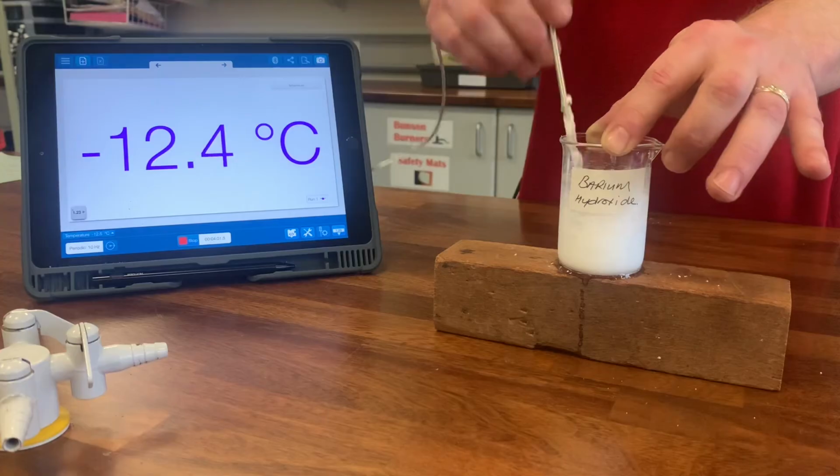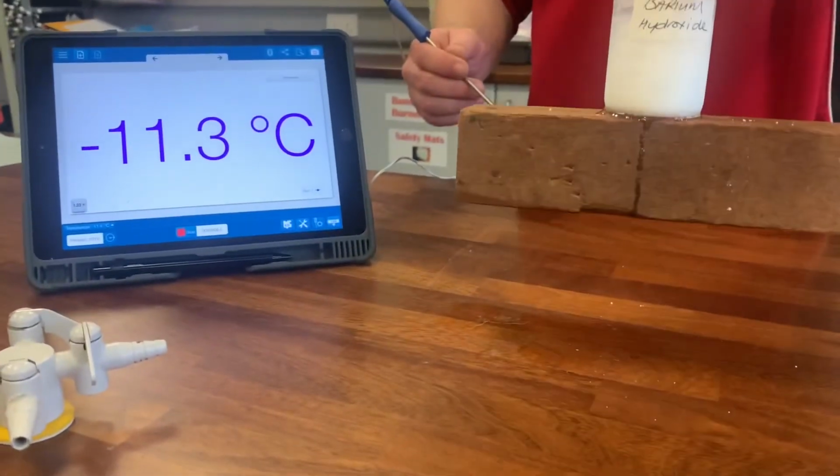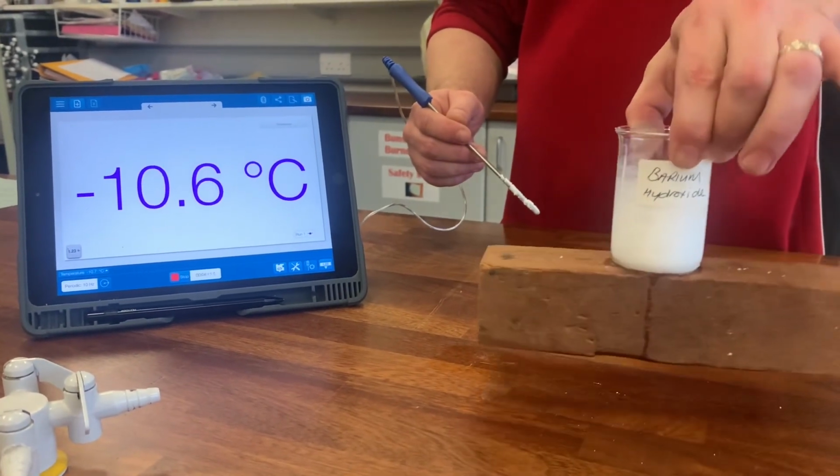And if we try to lift the beaker, what will happen? The water has frozen and has joined the beaker and the wood together. That's what makes it a pretty cool demo to do.